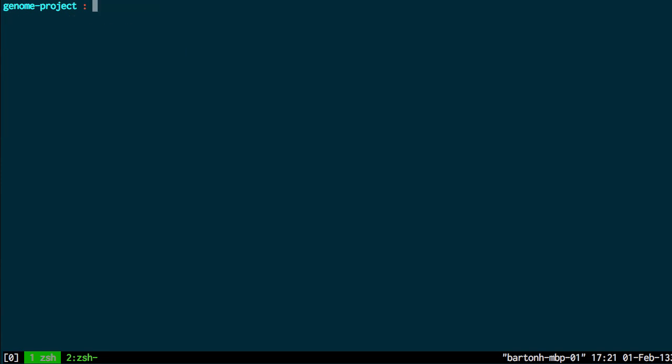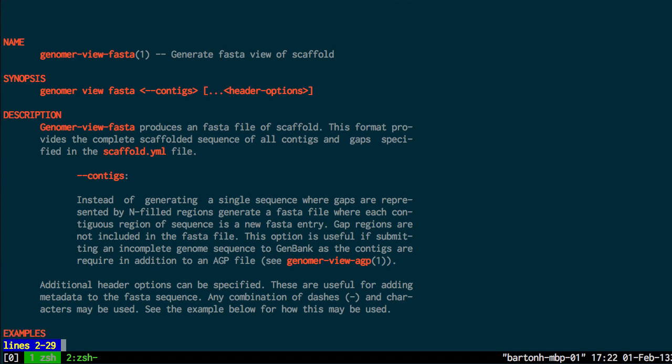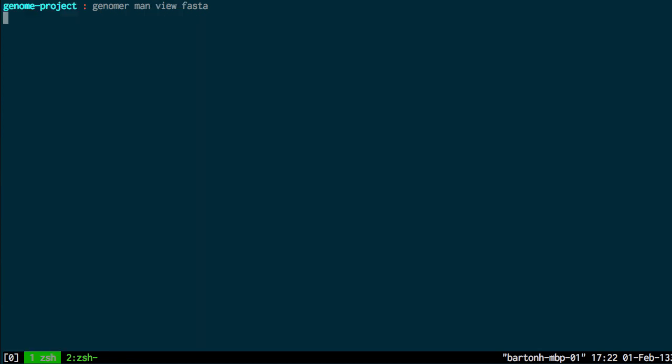And I'm going to create a FASTA view of my scaffold first. And that's using the FASTA command. And again, Genoma man view FASTA gives the man page for generating FASTA views of the scaffold. With an example there.